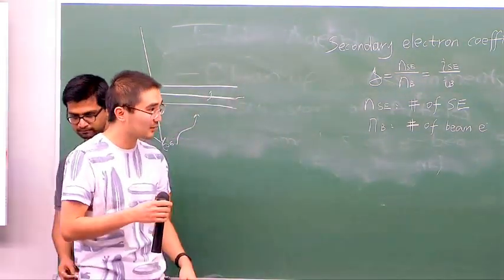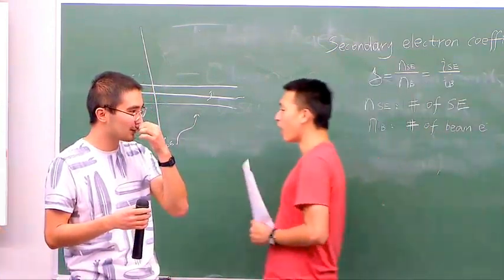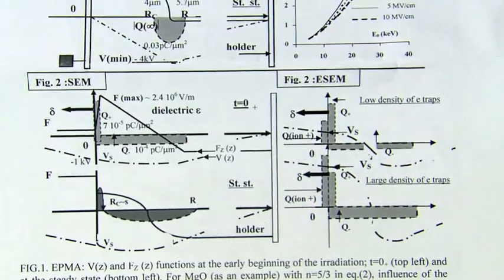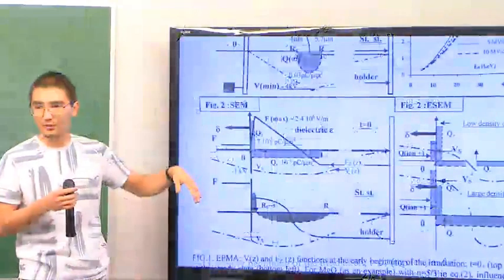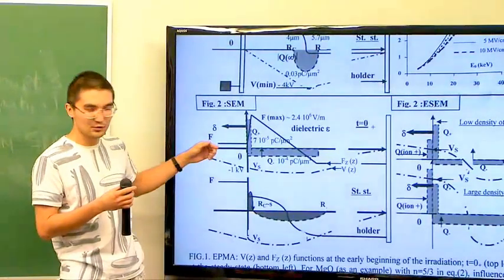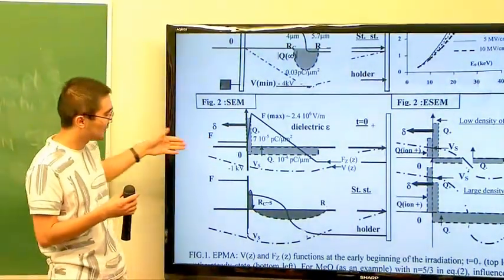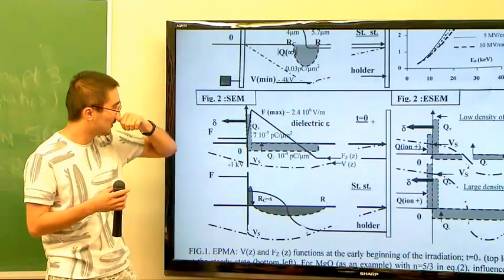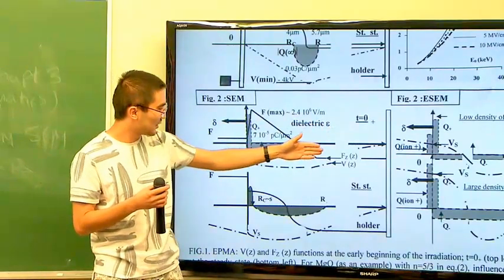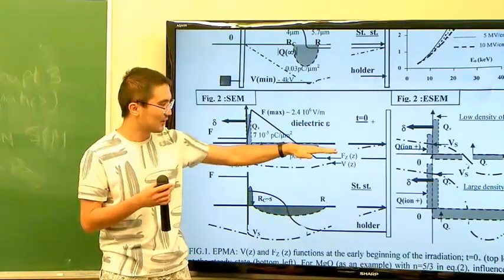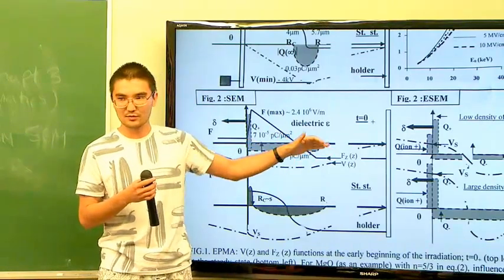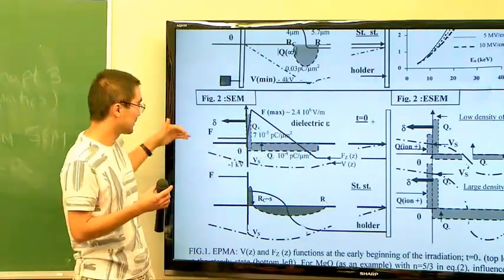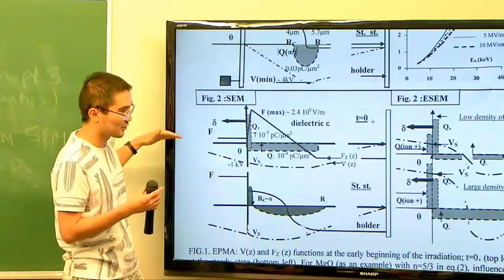For SEM it's a little different. In EPMA you had a conductive layer, but for SEM you don't have a conductive layer. What happens is your primary electrons penetrate the sample. At time equal to zero, electrons penetrate and it builds up a negative charge because negative charges accumulate and positive charges move to the surface, causing your primary electrons to slow down.